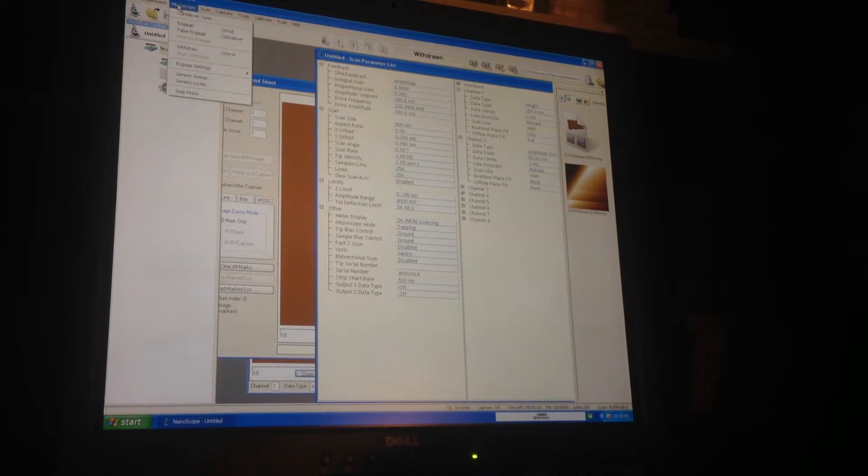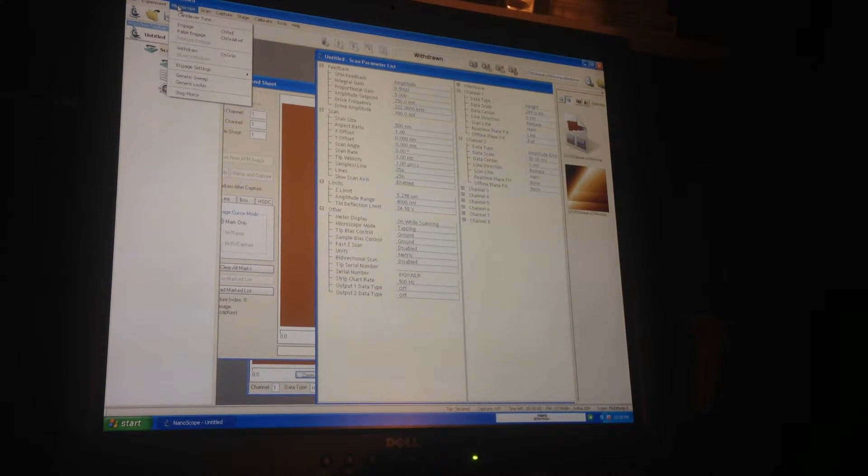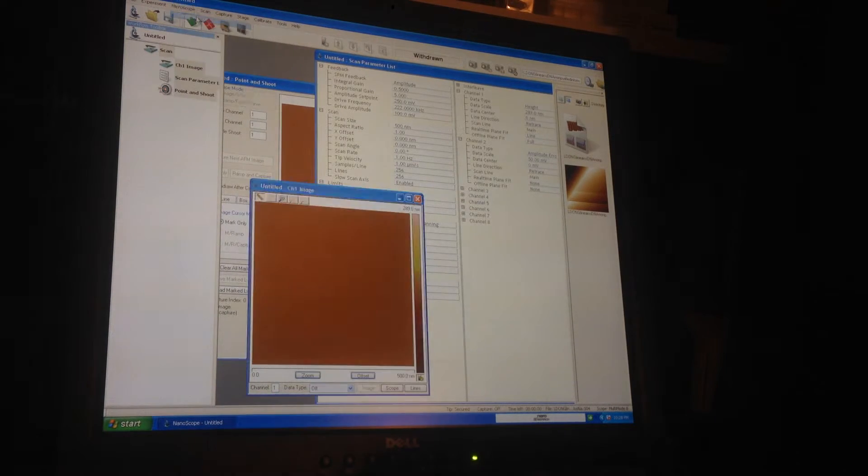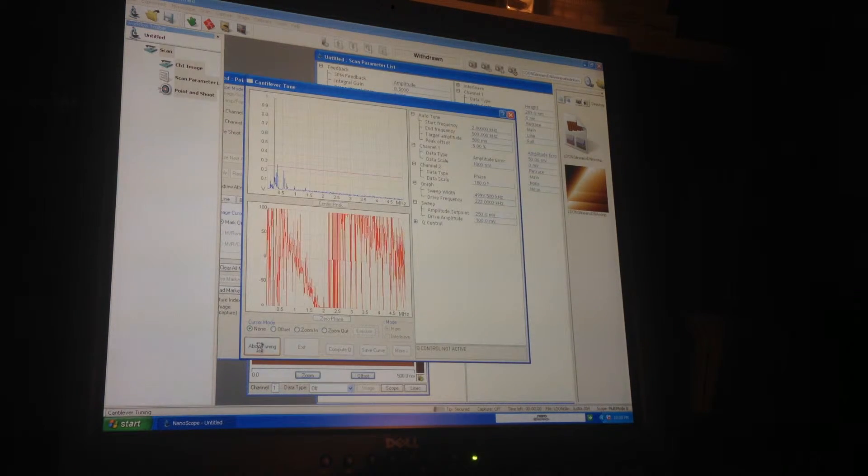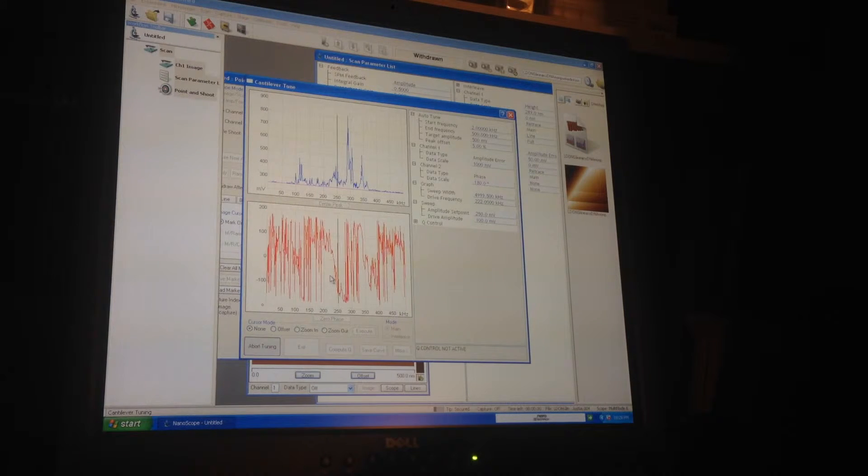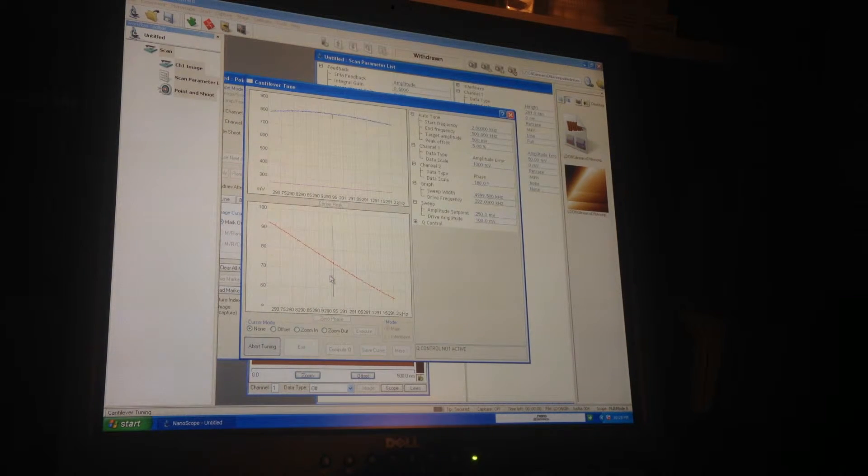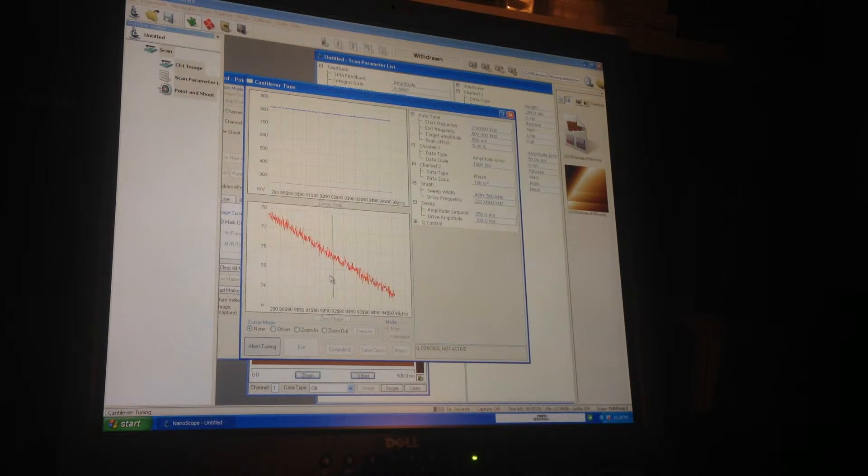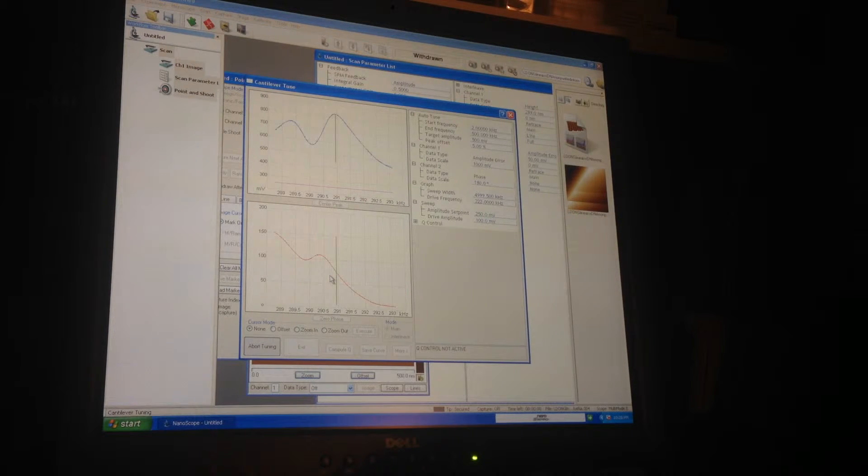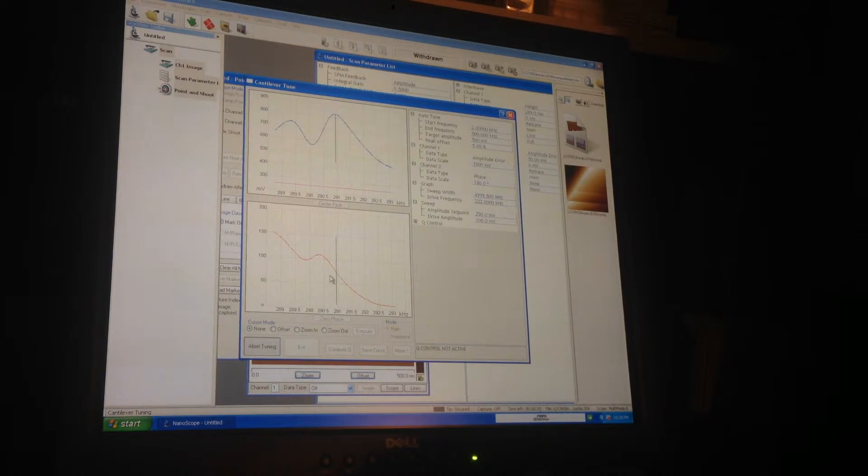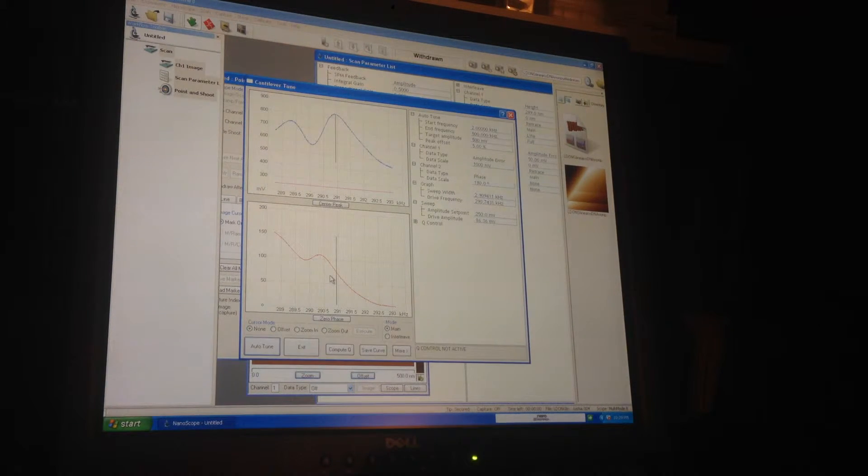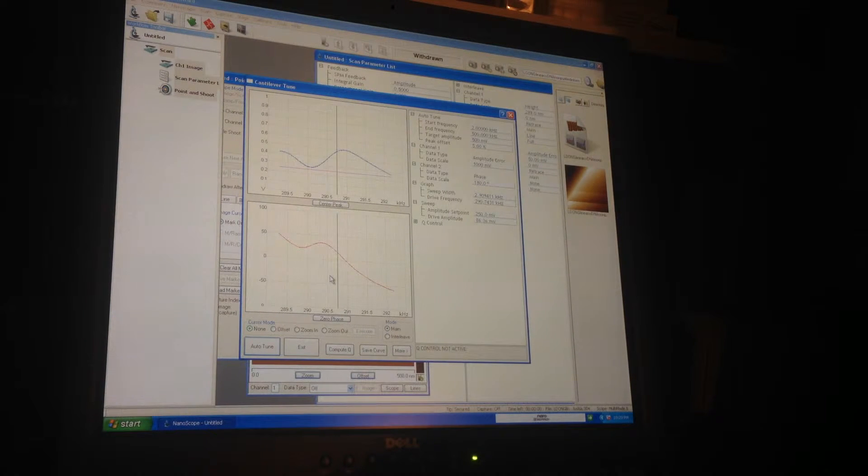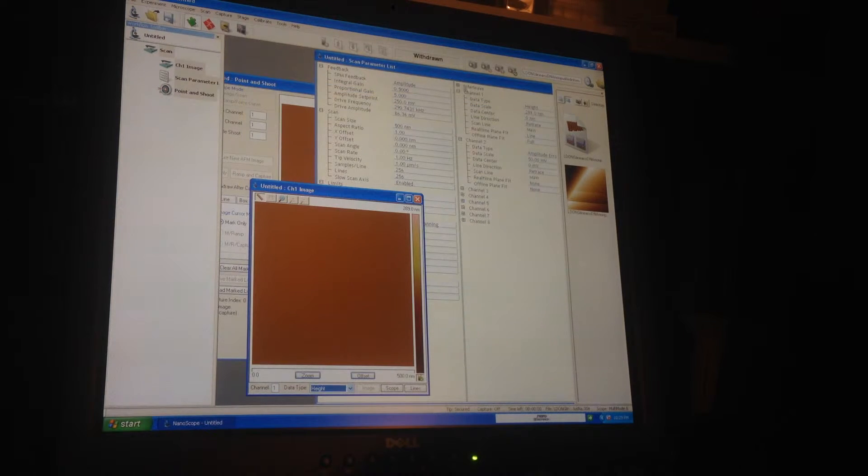I've just set up the cantilever as I'll show in another video. Then you want cantilever tune and you just hit auto-tune and you get all sorts of pretty graphs that I don't understand. You hope it doesn't give you an error. Okay, it didn't give an error, so that means it's fine.